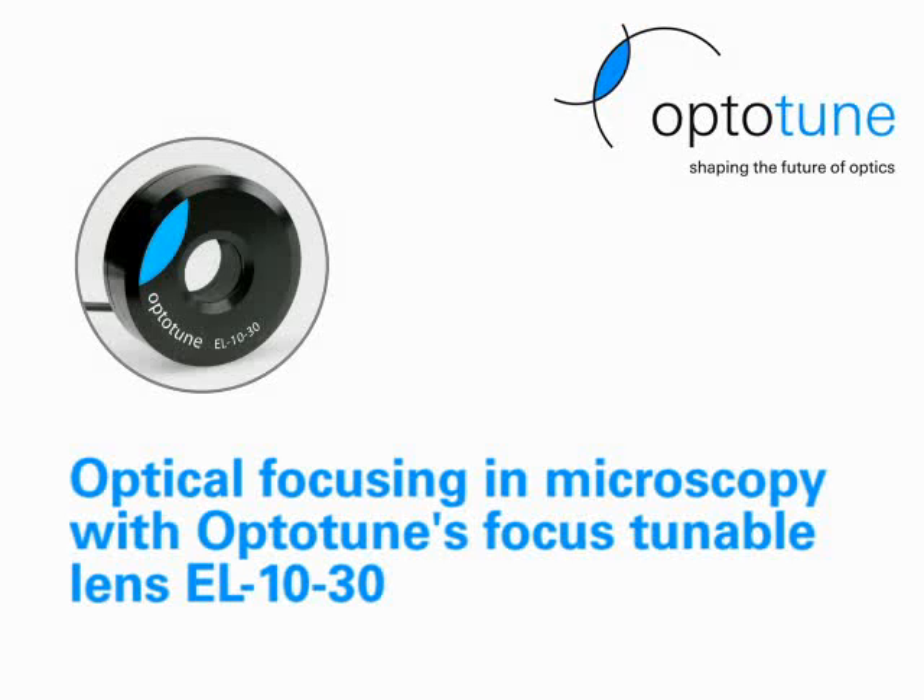In this video, we demonstrate how OptiTune's electrical lens EL-1030 can be used for axial focusing in microscopy.